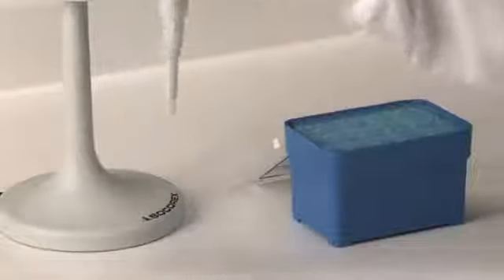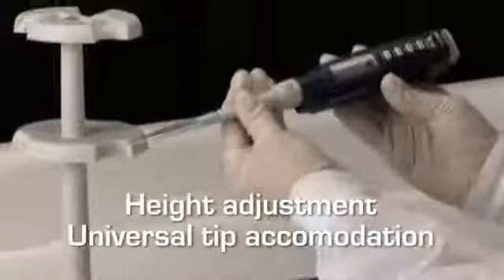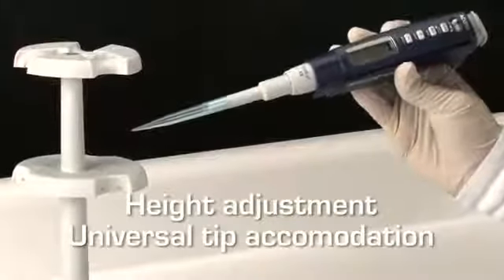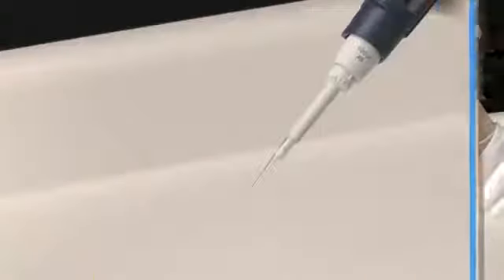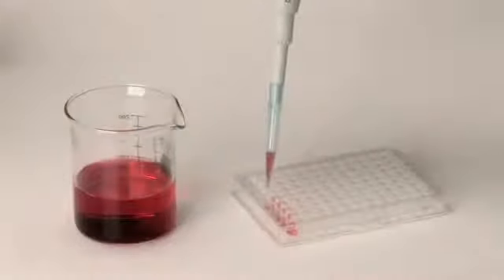Acura Electro Pipettes fit the most popular brands of disposable tips. The tip ejector is adjustable within a 4mm span, simply by turning the ejector sleeve. The reduced shaft length and conical end of the 926 XS improves drivability and access to small microtubes and microplates.